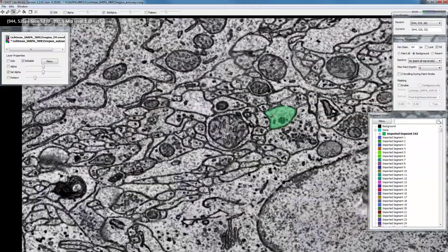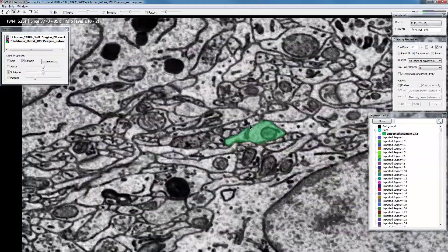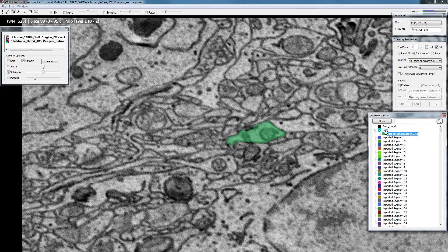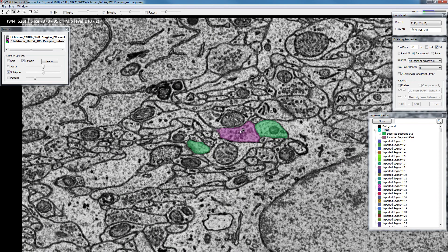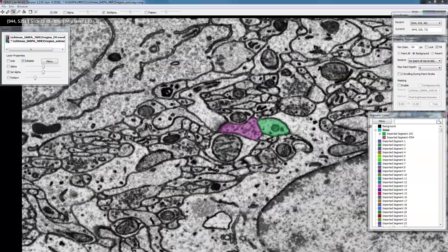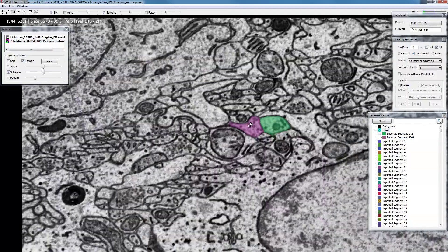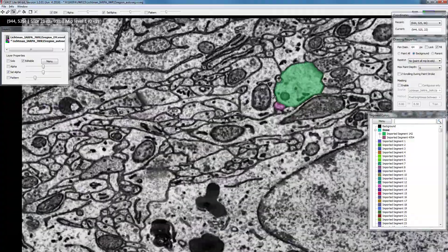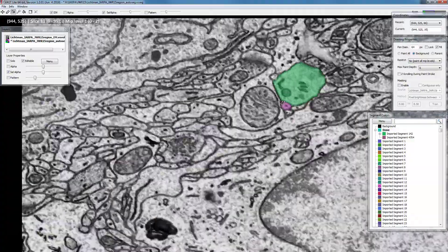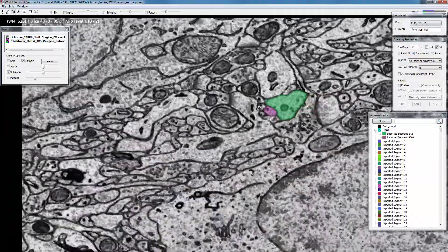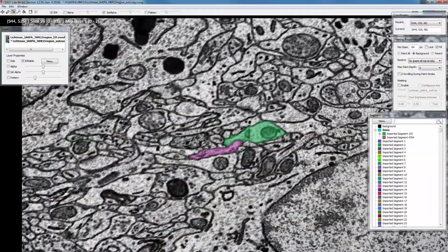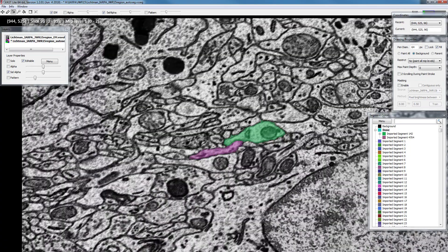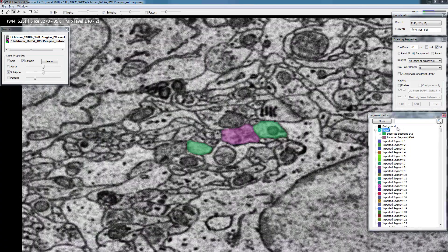We have corrected this one object. So now we choose another one — go again to the done folder, select some object and move it into the done folder. Let's select this axon — I know it's an axon because it has vesicles in it. It's been moved into the done folder. Now I'm following that one... looks like it's fine over here. Let's go to the other side — it looks okay, there's a little bit of a problem here but I won't worry about that right now.